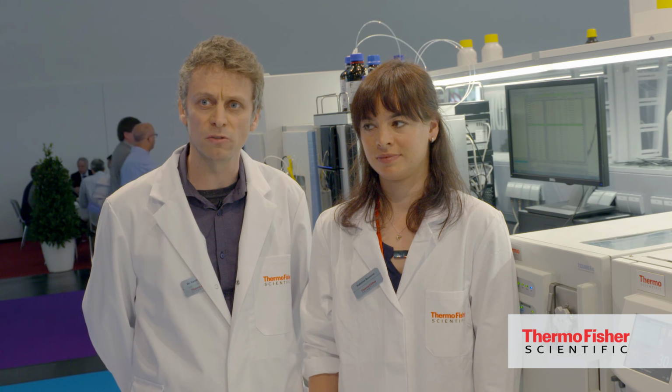For this, we applied two sample preparation methods. On one hand side, QuEChERS. On the other hand, an accelerated solvent extraction method. Then we had the extracts, we had the samples, and we analyzed it with both GC and LC-based mass spectrometry.